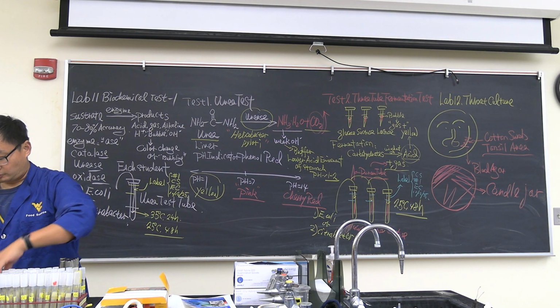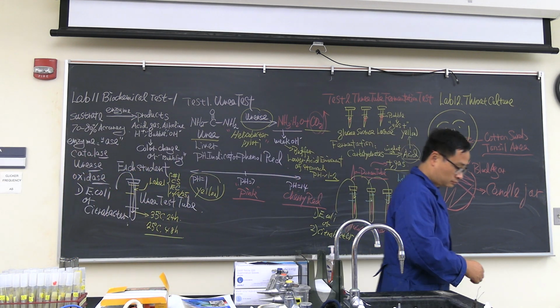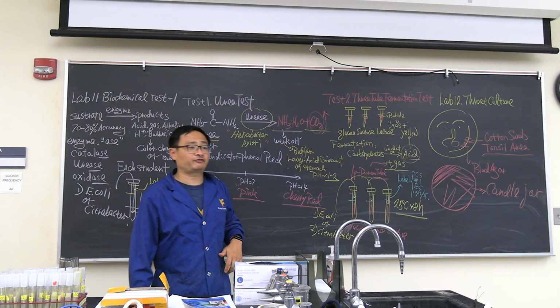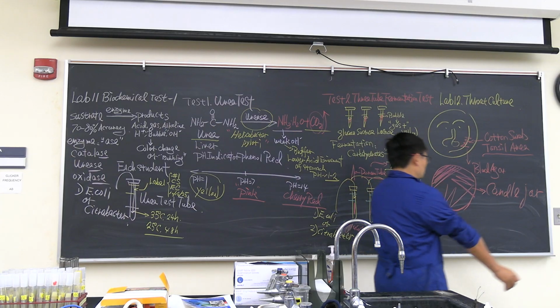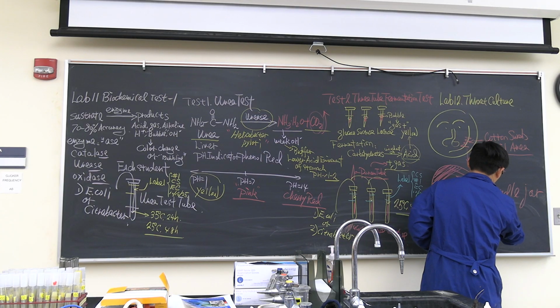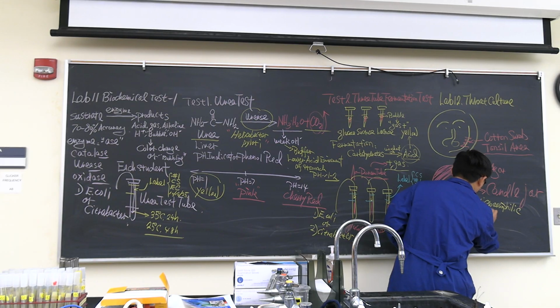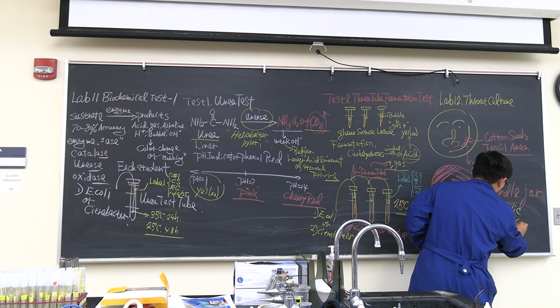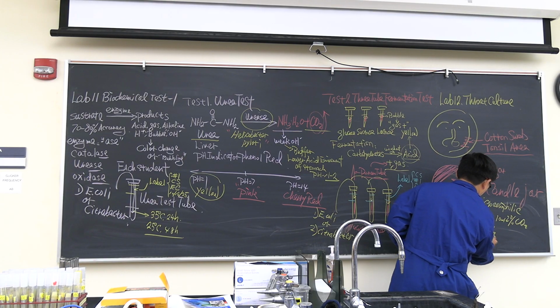Why is the candle important? Did you ever go to a cave? How do you determine there's oxygen there? You have your candle or some fire there. When you walk in, if the fire is gone, the oxygen is gone. The candle jar will create a microaerophilic environment. Basically 5% oxygen, 10 to 12% carbon dioxide, and the rest nitrogen, around 75% nitrogen.